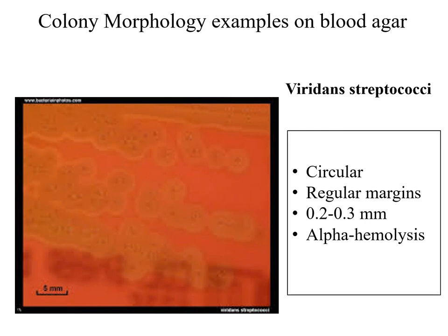These small colonies are circular with regular margins, 0.2 to 0.3 mm in size, and are characterized by being alpha-hemolytic — that is, partial hemolysis — which can be seen clearly from the greenish discoloration of the blood agar.